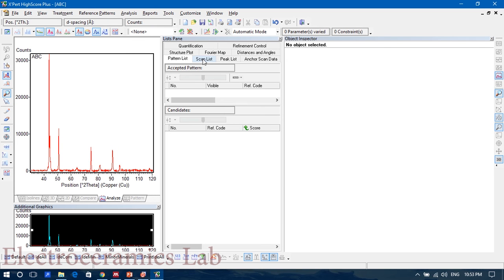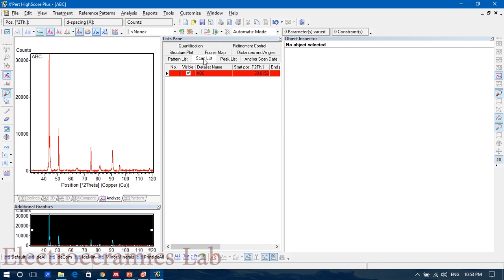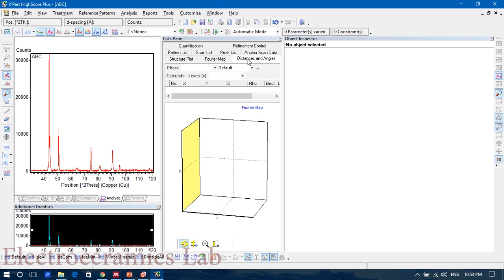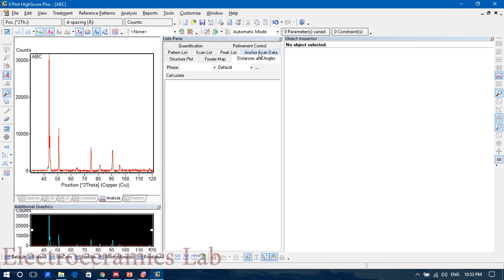You'll go to Distances... sorry, Distances and Angles... sorry, Anchor Scan Data.